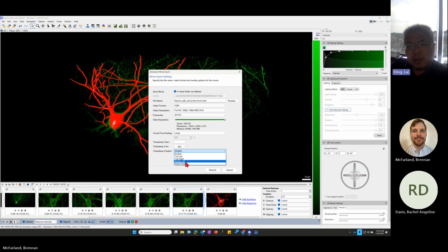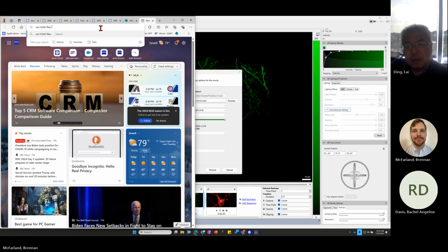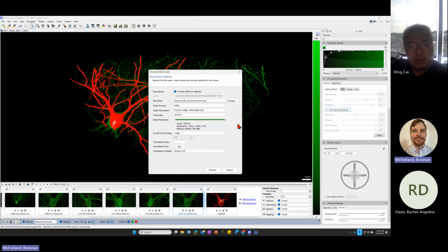I'm not familiar with the video format. Is H.264 compatible with PowerPoint? I am not sure. Let's see. I cannot type PowerPoint. I think so. Yes, MP4 files encoded with H.264. So this is H.264 and it has that .mp4. So yep, it should be native to PowerPoint. Okay, thanks. So let's see what this looks like.